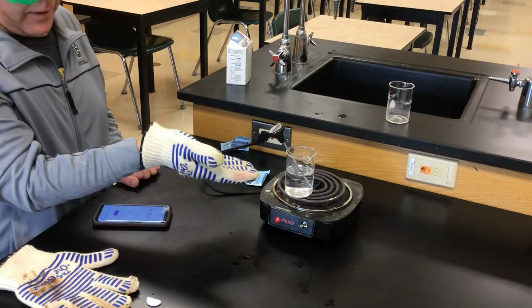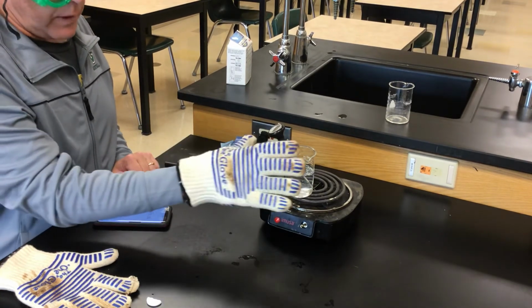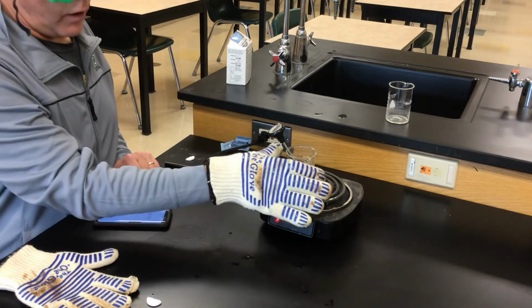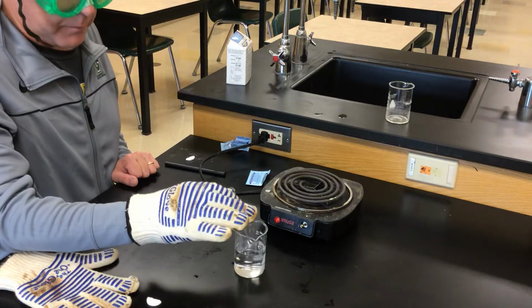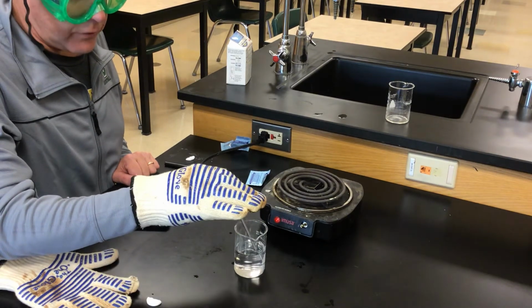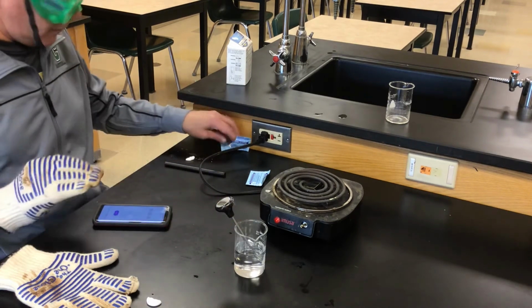Now that the heat is hot, glass is a really good conductor of heat. That's why we use glass beakers, and the water heats very quickly. Plus glass won't break or anything. The only problem with glass when it's hot is it doesn't look hot. Okay, we're at 36 degrees.